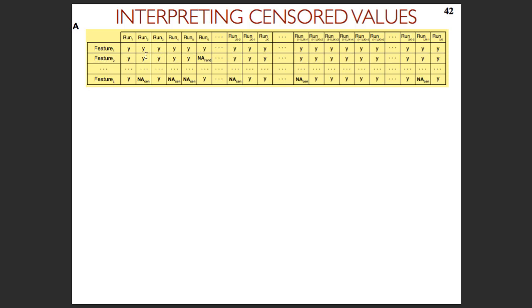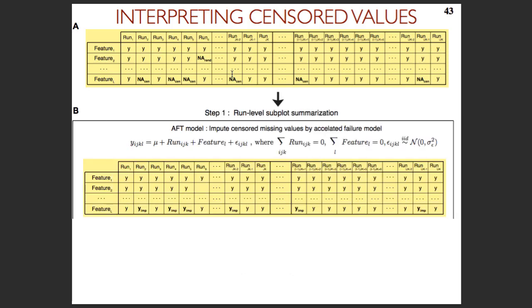Also, later on I will talk about labeling, if we have labeled reference or any type of standard. If we happen to have a missing value with the standard, we will leave it as missing because it's unlikely that the standard was below the limit of detection. But other than that, every missing value, we assume that this is due to low abundance. And so the very first thing we will do is to work with censoring. In statistical literature, there's a lot of work on how to accommodate missing values which are informative missing, when they're not just randomly missing, but they're missing at low abundance.